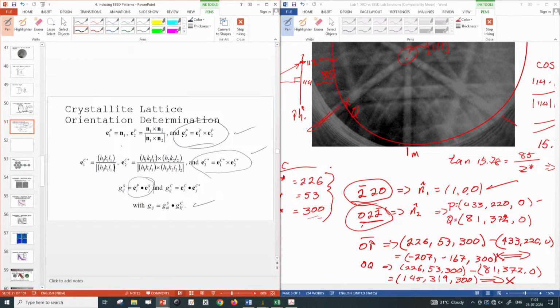Okay. Right, so we know where our specimen is, we know where our phosphor is. The crystal we know, and we can create something from the phosphor frame, the exact same representation in the phosphor frame coordinates as well as the crystal frame coordinates. And from that we can pull out our direction cosine matrix that gives the orientation of the lattice.